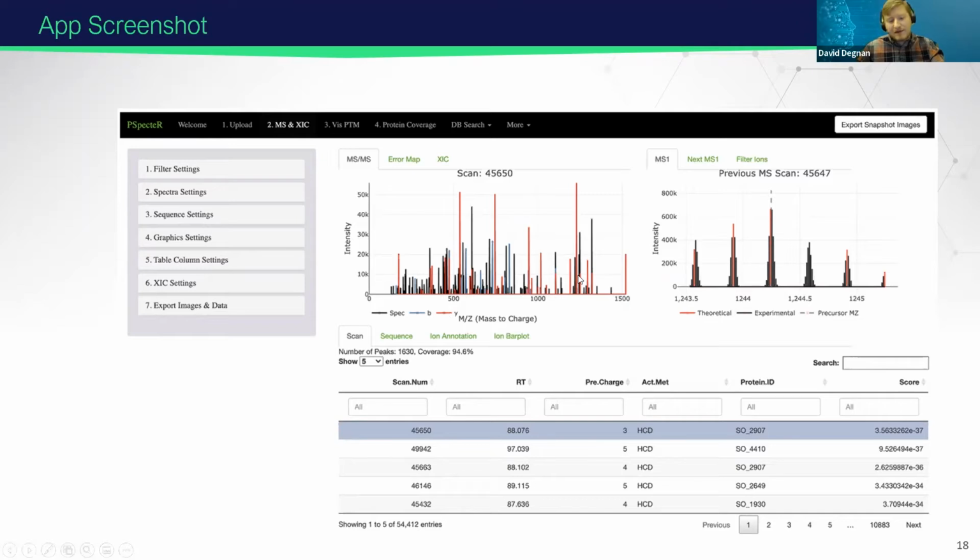So we see the matched profiles between the calculated and experimental m/z. We also get a little snapshot of the MS1 that this data comes from. So you could see from the parent ion, from this non-deconvoluted data, where the calculated value for the entire fragment is, where its mass should be, and where the instrument selected from. And it's ranked by score. So the best match is going to show up first.